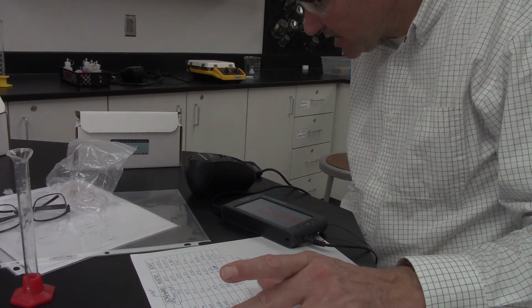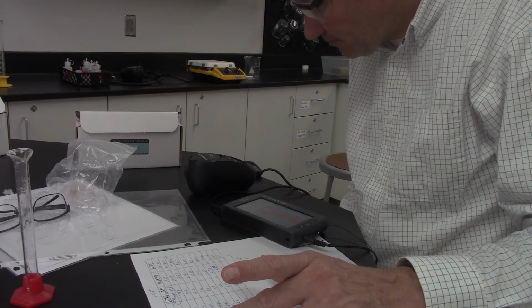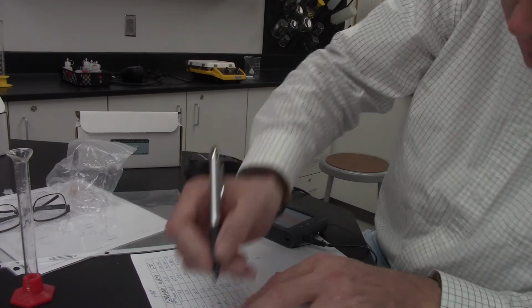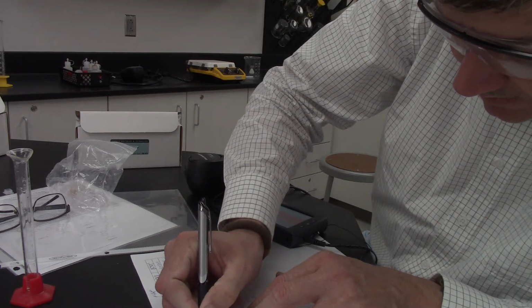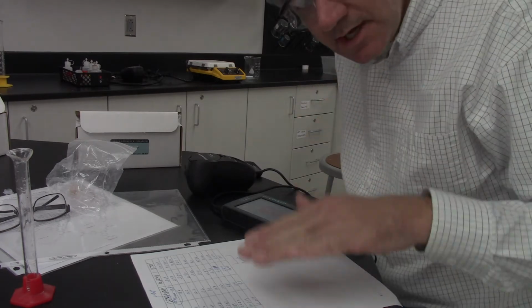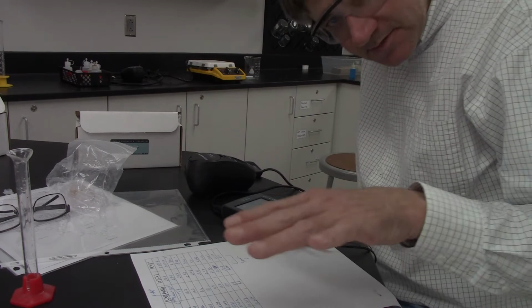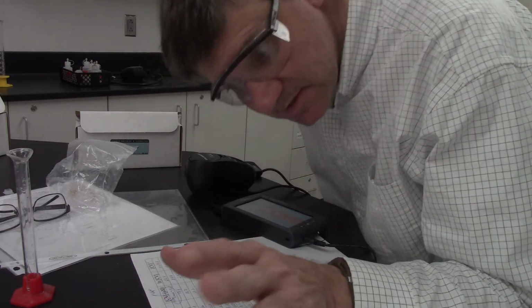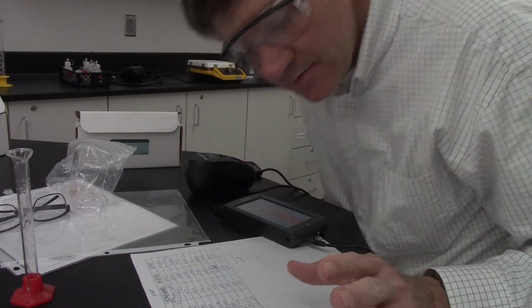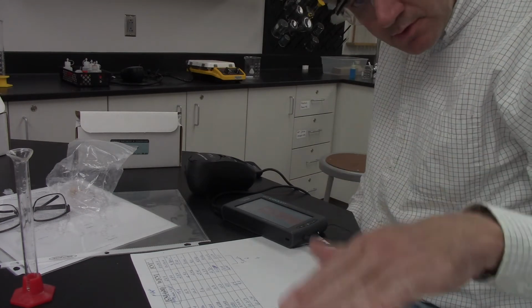So at the end of 30 seconds, we're at 0.745. We dropped from 0.770 down to 0.745. Trust me, this is kind of the boring part, because we've got to do this for like 300 seconds, and we're just going to keep recording the absorbance.